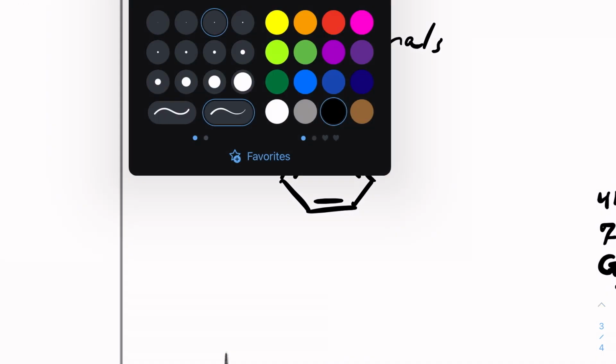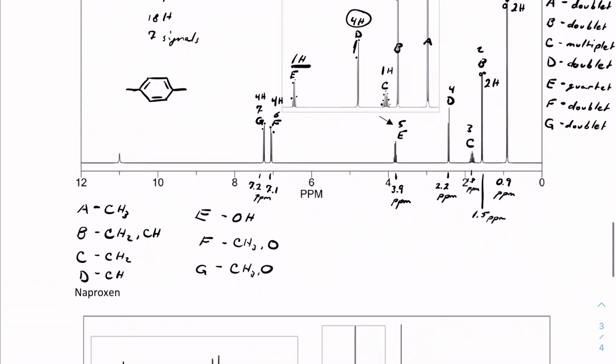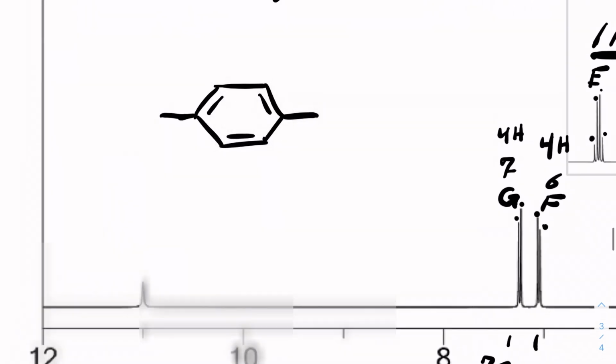And we're going to go ahead and head back into our drawing. So then what we know is that we have branches coming off here and here. And we have some CH3 groups and some CH2 groups that we have to fill in. And the way that we can figure that out is through our connections, as well as how all the molecules are oriented and their neighbors.